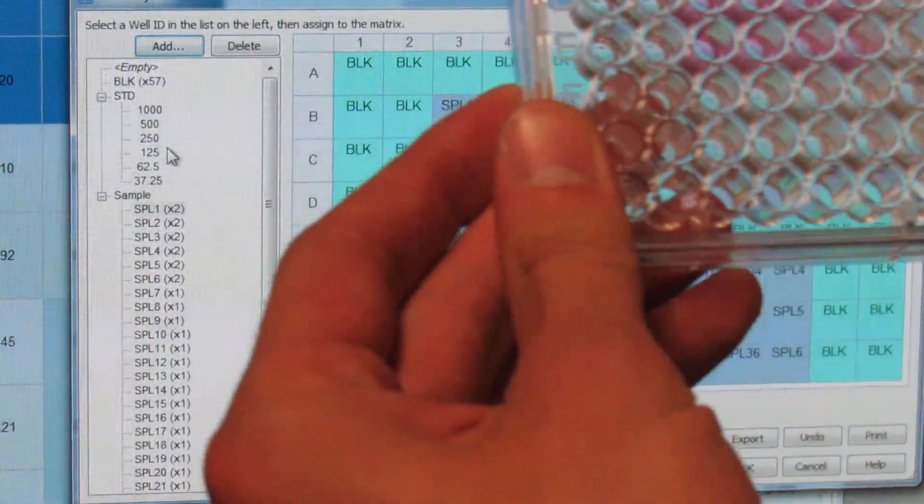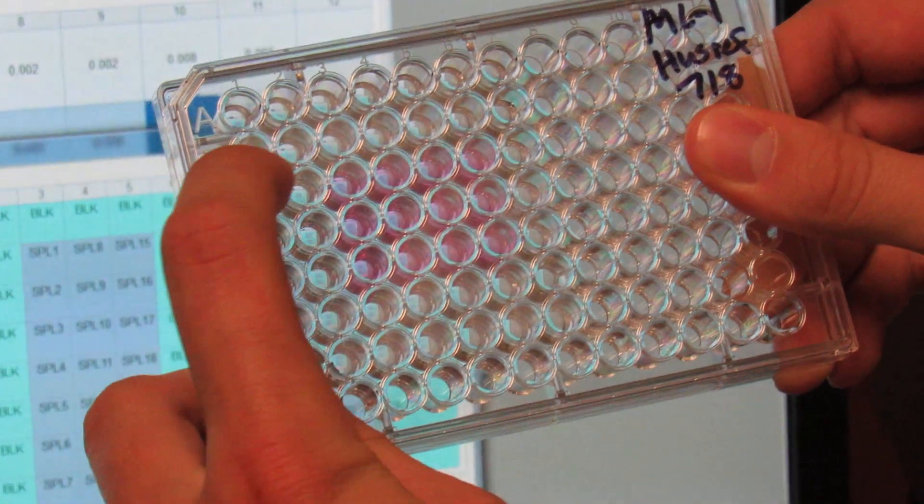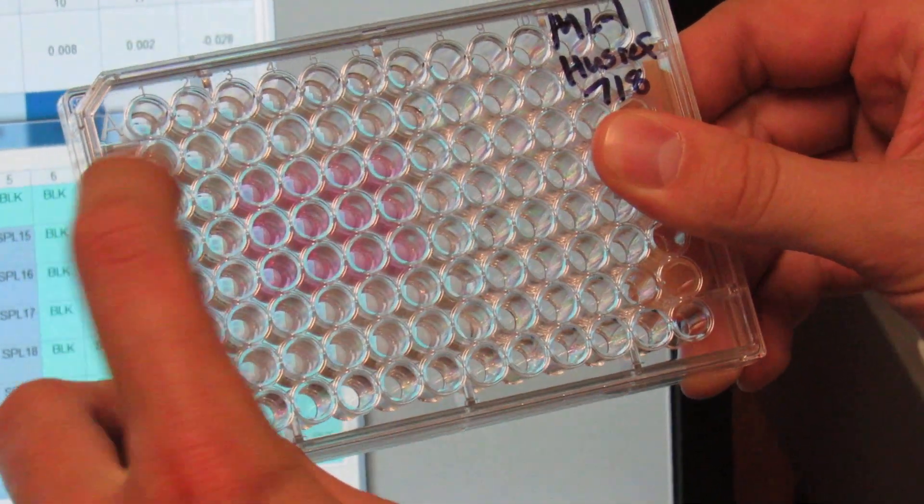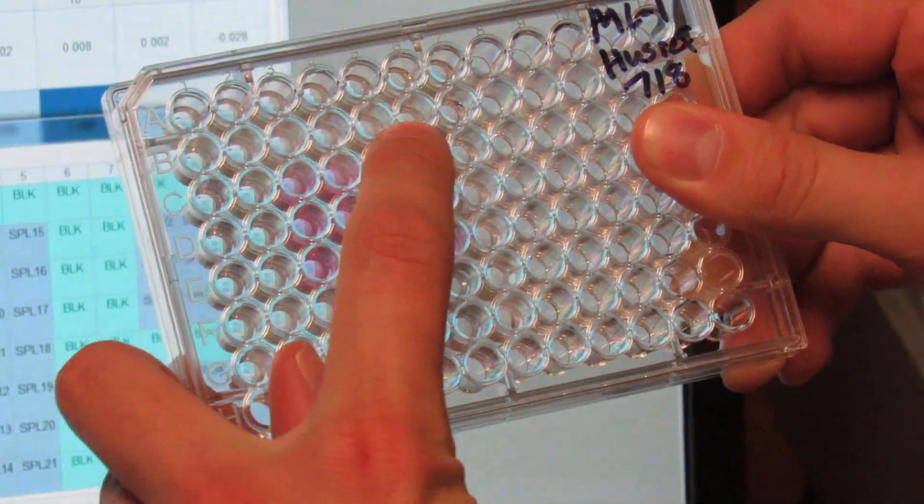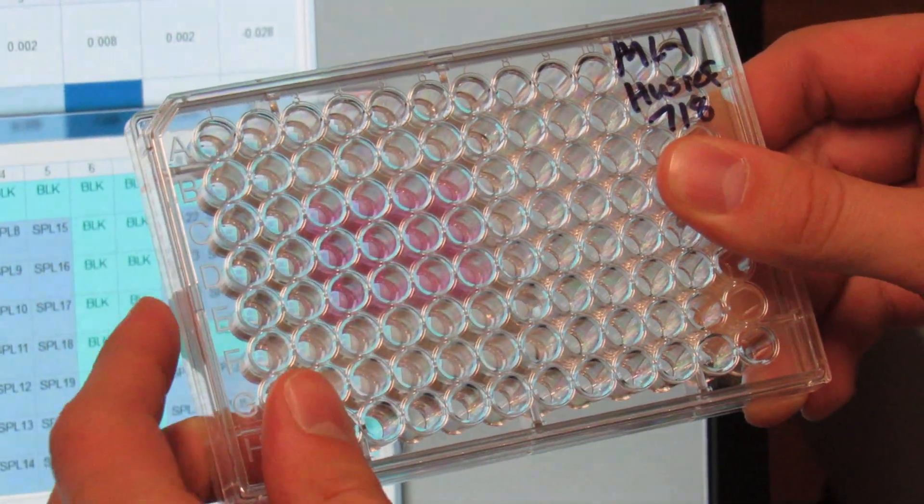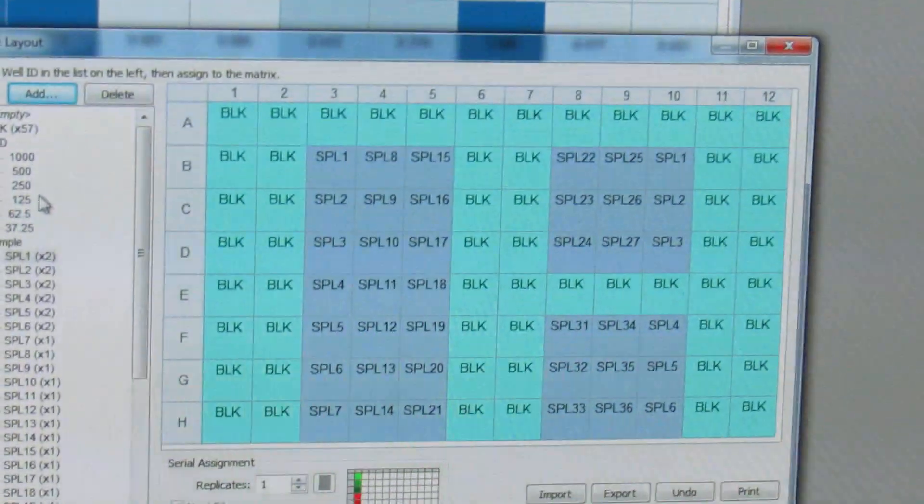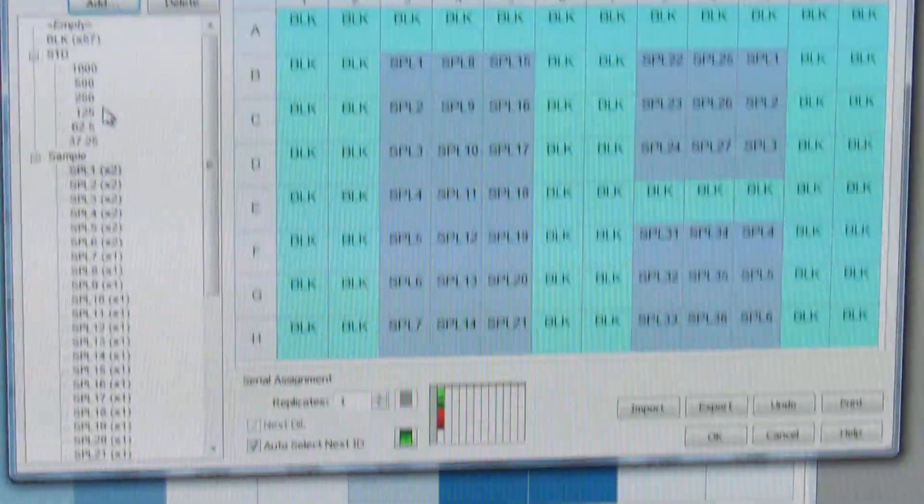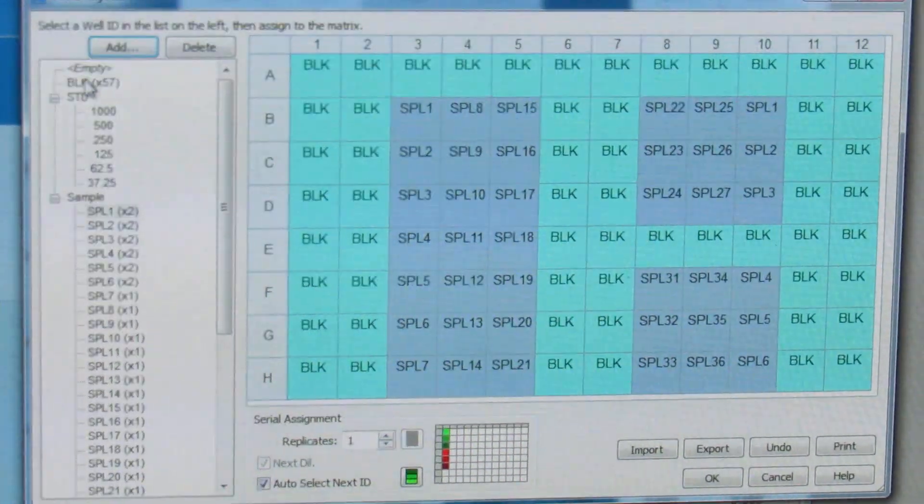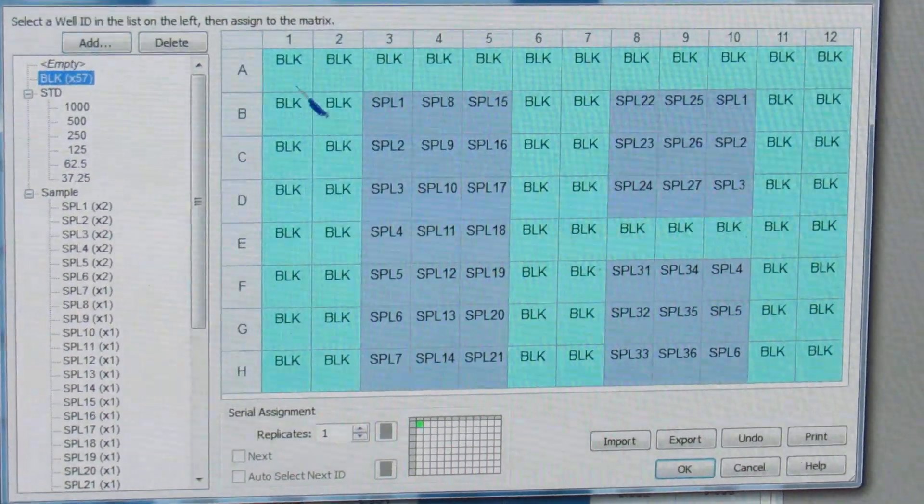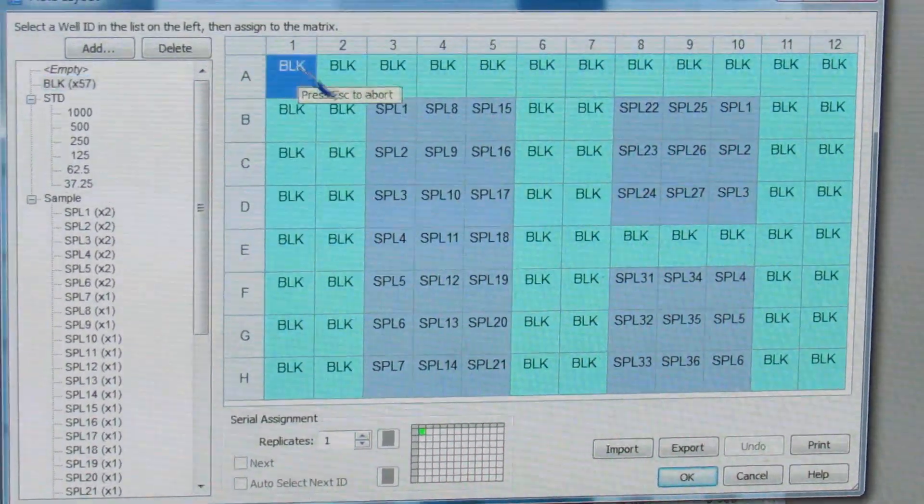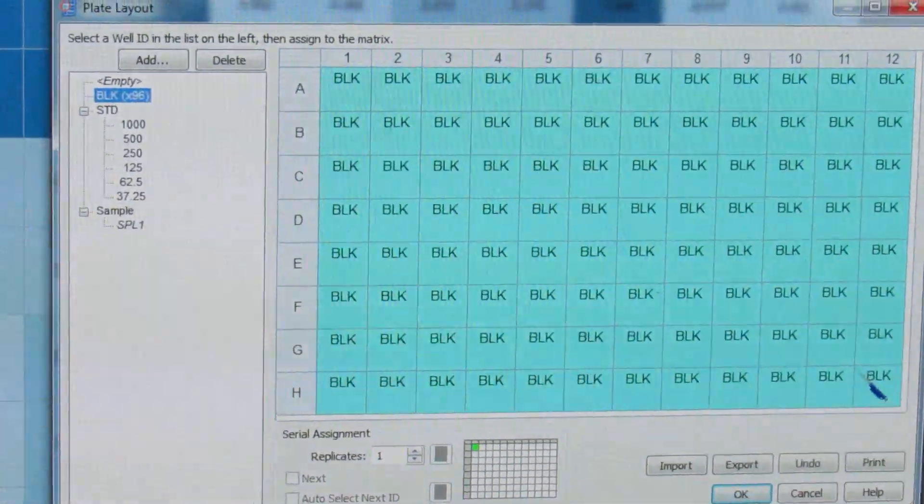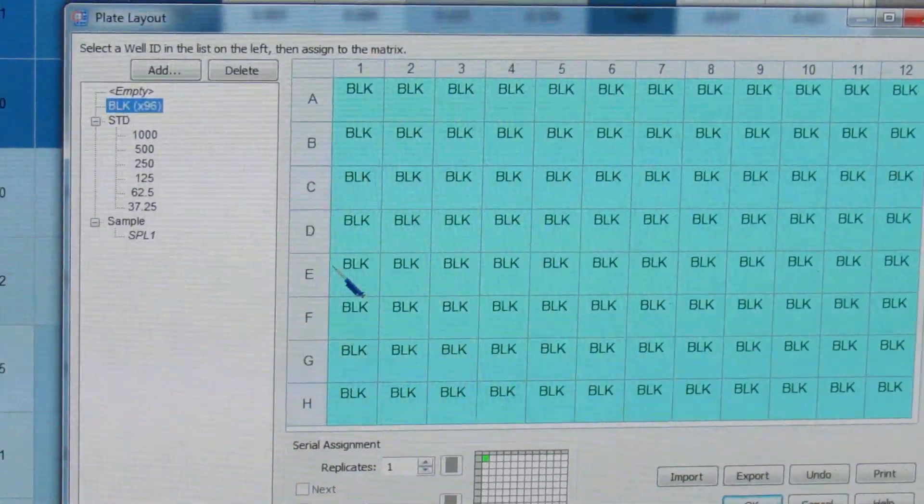If you look at the current plate that we are working with, we only have C through E, 3 through 6 with our samples, everything else is a blank. So to set this up, you will select blank right here. And I always just start off by making everything a blank to make sure I don't miss anything.